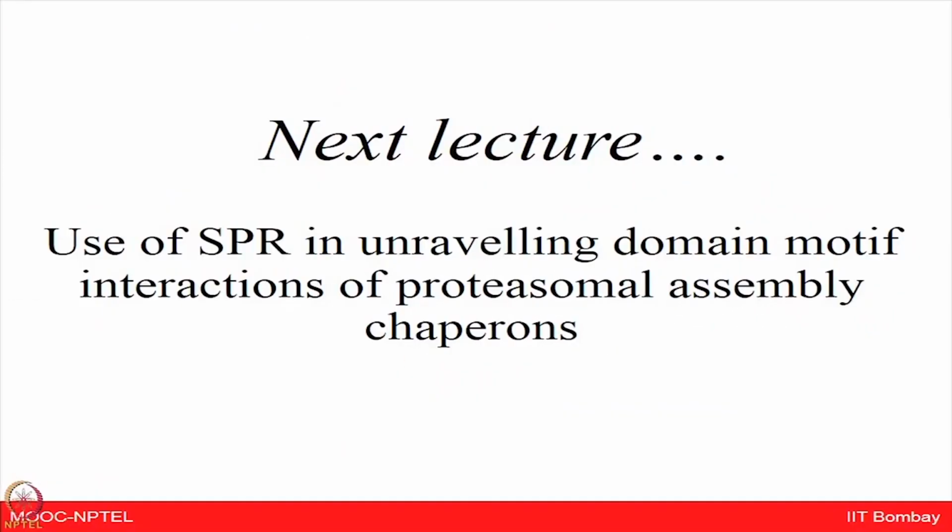And that is where your understanding of these experiments and the nitty-gritties that Dr. Uma talked to you about today becomes very crucial, to delineate what is the right binding and the data obtained from that, the sensorgram, versus what could be an artifact which comes from the bulk effect. Some of these concepts will be taken further in the next lecture, where we are going to have a scientist coming from Tata Memorial Center, ACTREC, who is going to talk to you about applications of SPR technology in biologically relevant problems. Thank you.